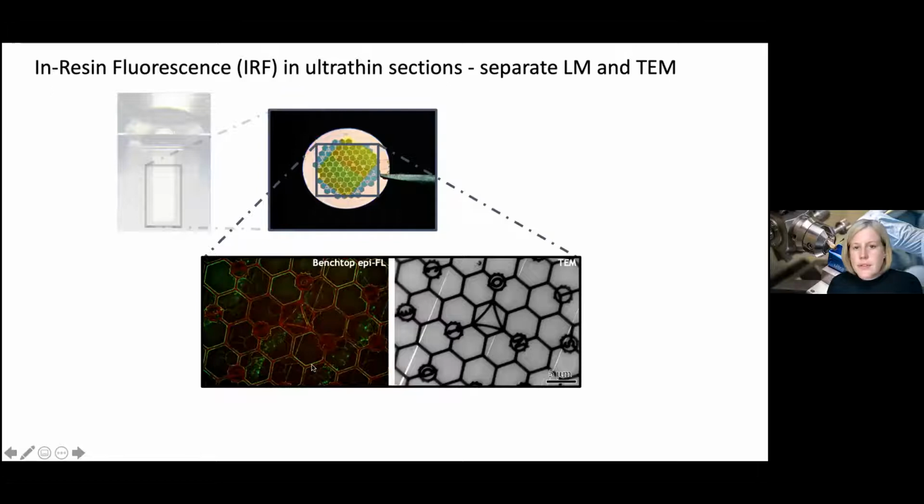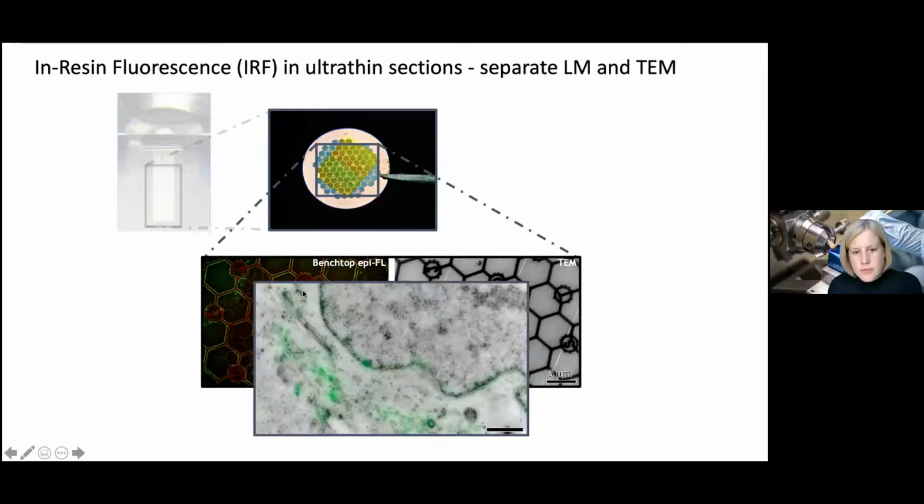And in fluorescence, you're imaging sections that are below 100 nanometers thick. So you're already working in super resolution in Z, and you've removed all of your out of plane fluorescence. So the overlay of the two signals is very good. So here you can see that diacylglycerol is sitting on the nuclear envelope, on vesicles in the cytosol, and at the tips of the Golgi apparatus.